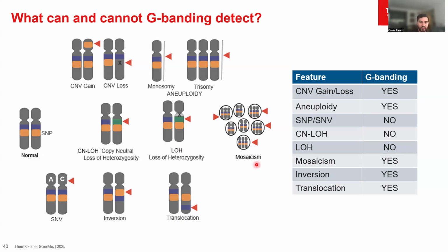And then finally, I briefly mentioned the mosaicism part, but in those assays, and typically in all of cell culture, the goal, as we discussed a little bit, is to have a clonal population. But sometimes if a particular cell in your culture acquires a mutation that gives it a proliferative advantage, it can start to grow in number and slightly take over that culture.